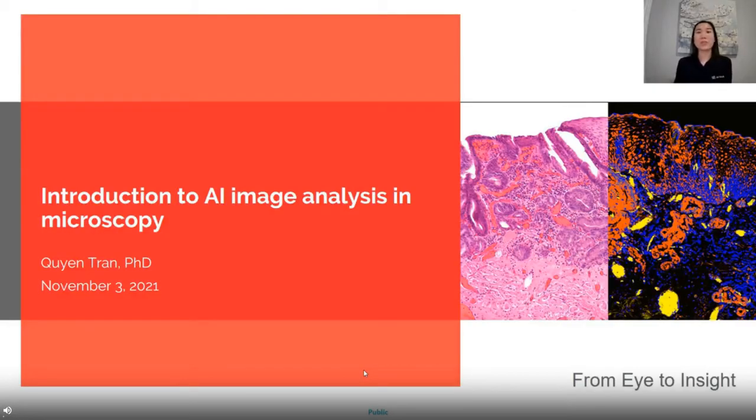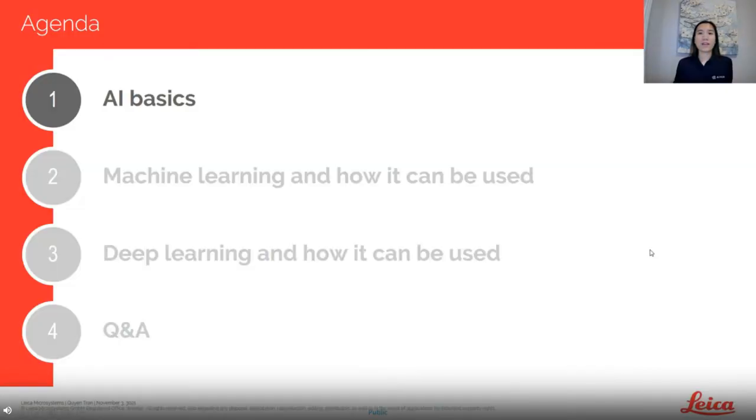Hello, everybody. Welcome to the webinar, and thank you very much for joining us today. My name is Quyen Tran, and today I'll be doing an introduction to AI image analysis in microscopy. A quick look at our agenda. We're going to go through some AI basics and then specifically machine learning and how it can be applied in the microscopy field. We'll then talk about deep learning and how that is applicable, and then do a Q&A session so that you have plenty of time to ask me questions about the topics that I covered here and potentially how these tools and applications can be utilized in your particular research.